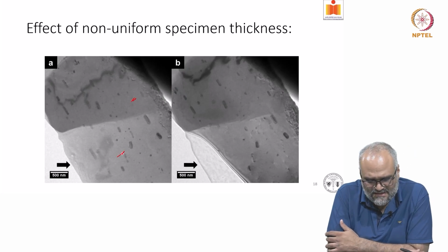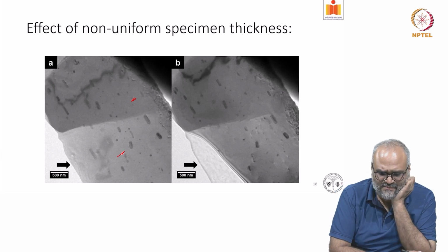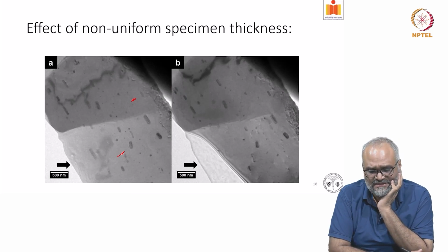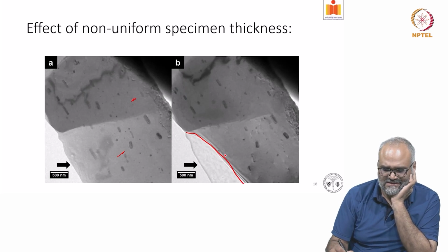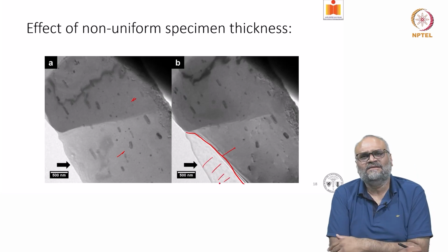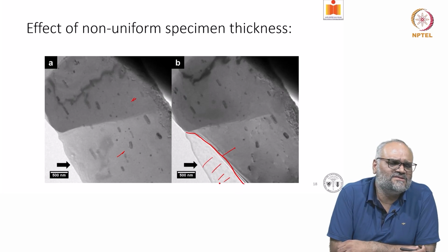You can see that in the thin regions, when you heat the specimen to an elevated temperature beyond 500 degrees centigrade in this situation, the surface diffusion is so dominant that the specimen becomes like this, and you're left with the aluminum oxide shell. So not having uniform thickness also prevents you from making observations that are relatable to the bulk effects that you typically see.